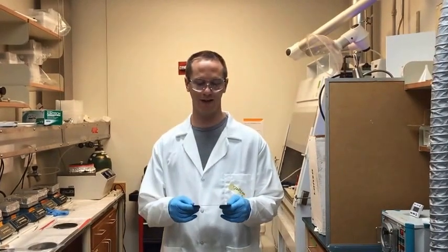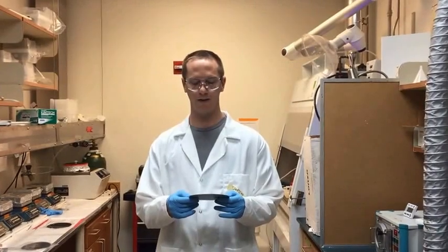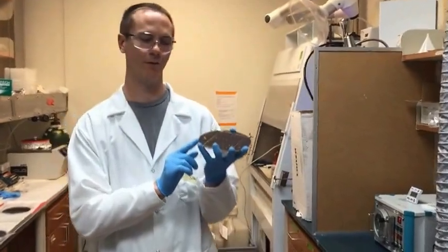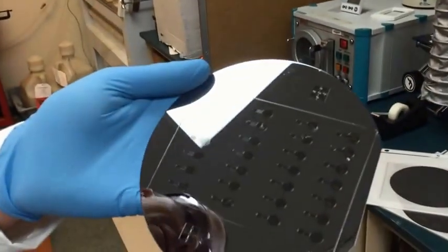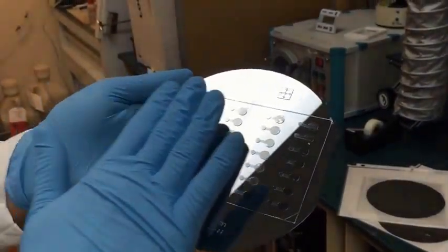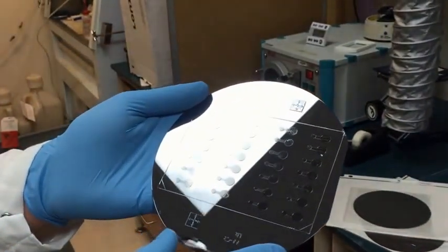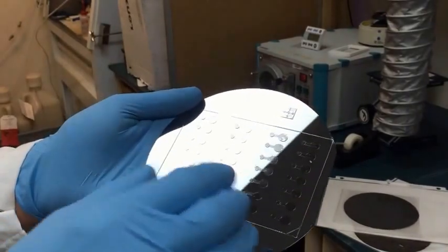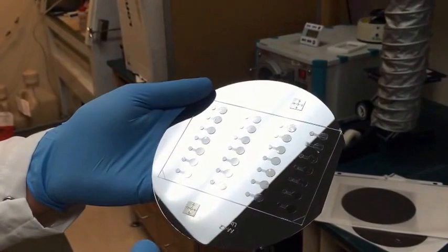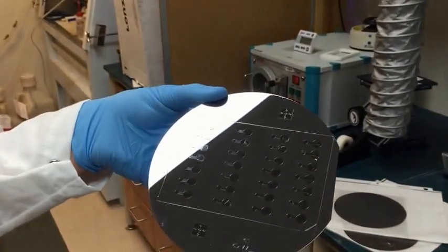This is a video on how to make an SU-8 master for doing soft lithography. The whole goal of this process is to create something like this — a silicon wafer with features defined by epoxy on top of it. We're going to spin layers of epoxy over the silicon wafer, expose portions of it to UV light, which will harden those portions. After doing this multiple times for multiple layers, we will rinse away what's not been exposed to UV, and we'll be left with what we have here.